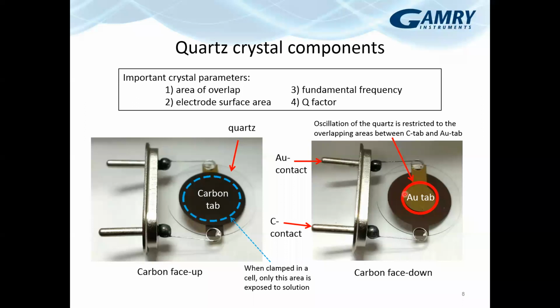And so the area of overlap is, many times, different than the area where your electrochemistry occurs. And for the most part, most people new to EQCM forget this mismatch. We'll go over why this is important later, but essentially, if you pass current in a larger surface area but only measure mass in a smaller area, and you try to correlate the two through Faraday's law with the mass change on the crystal, you'll notice that there's going to be a mismatch.